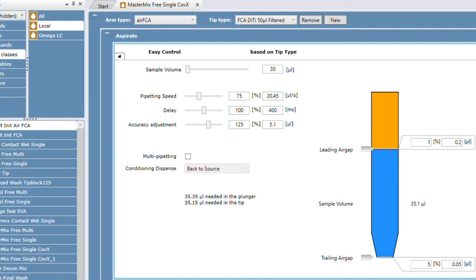The delay is the percent at which you're going to multiply the pipetting speed to slow things down. If you want things to be slower, you can increase the delay up to 200 percent. Accuracy adjustment is an interesting one — it's not really used too often, but it's like a compensation factor. For example, if you have a very viscous sample and you're pipetting 20 microliters but only getting 18, that's where you would put in your accuracy adjustment.